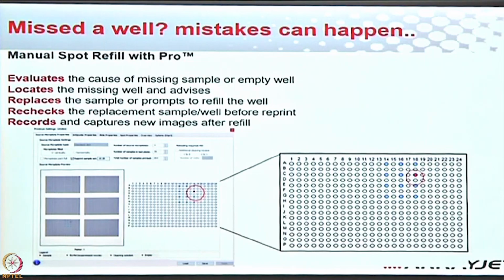So you can take the plate, you can have a look, yes, it's missing. It's right, I've genuinely forgotten, which is fine. You put a buffer in, or you say, okay, it's not too late. If I missed it, I can put a sample again. So you go to your lab, quickly prepare a sample, put it back in, put the plate inside the reader, and it starts where it has left off.